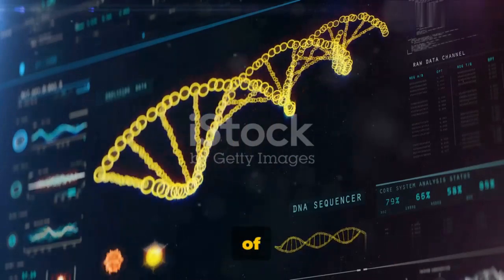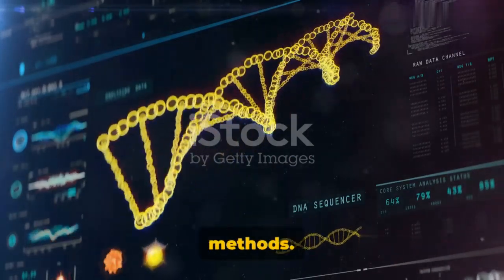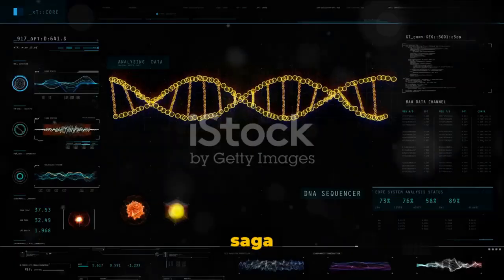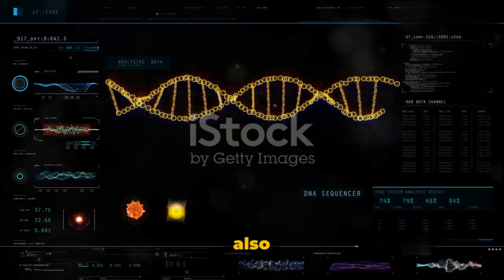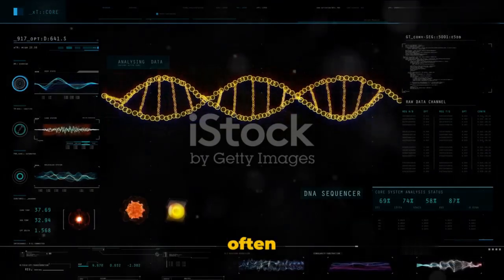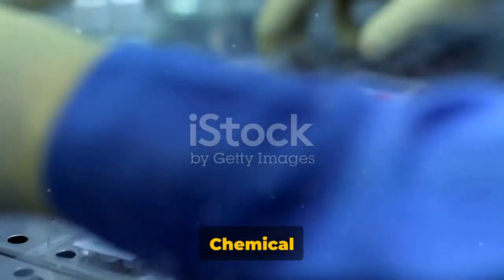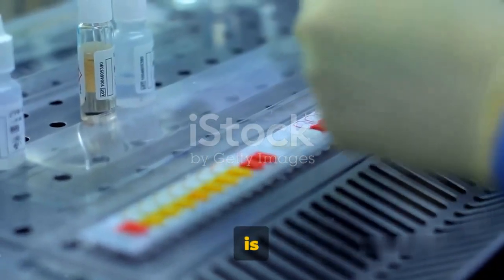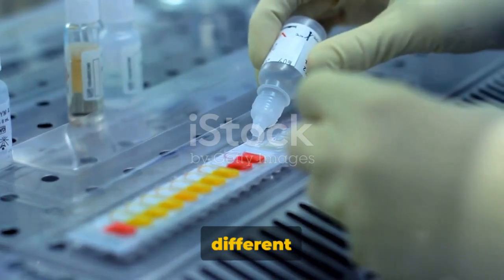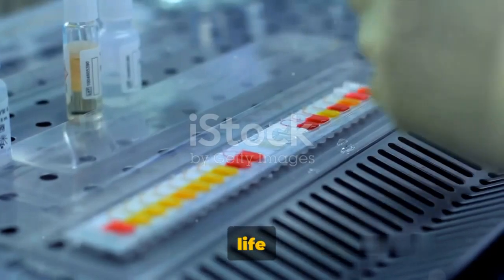Yet, the story of DNA sequencing is not just about the technology, but also about the methods. Two main approaches have risen to prominence in this scientific saga: the chemical method, also known as the Maxam-Gilbert method, and the chain termination method, often referred to as the Sanger dideoxy method. The chemical method, named after its inventors, is a fascinating process that relies on the relative chemical lability of different nucleotide bonds. It's a method that has its roots in the chemistry of life itself.